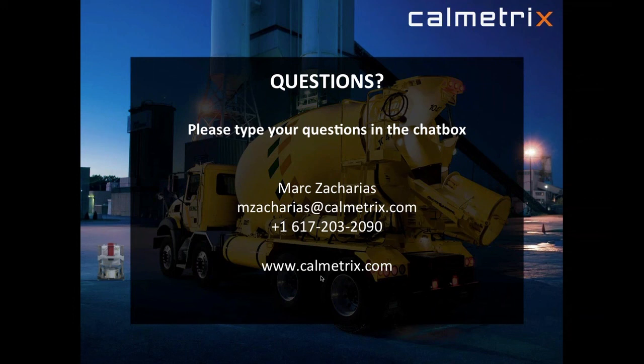Then the y-axis is torque, and the x-axis is speed. So it's qualitative in that sense.